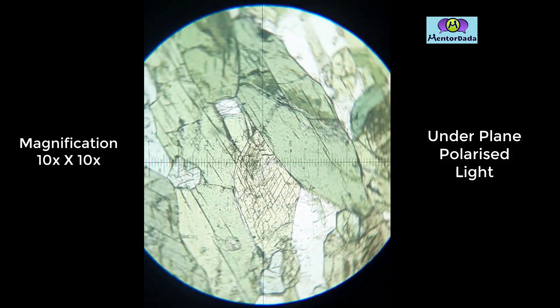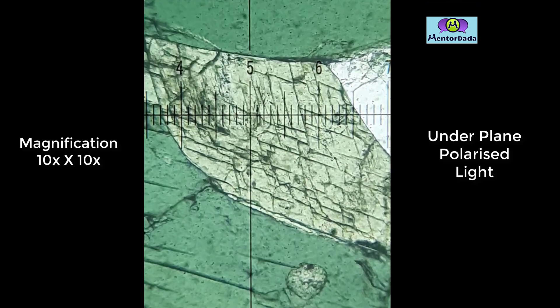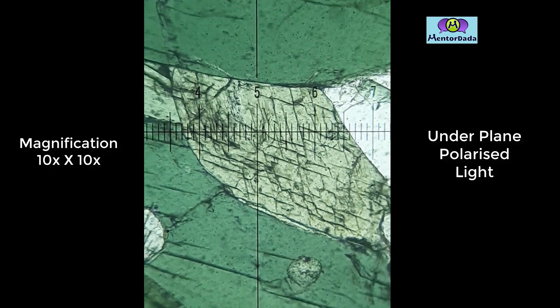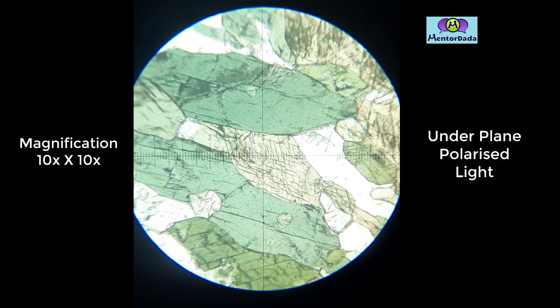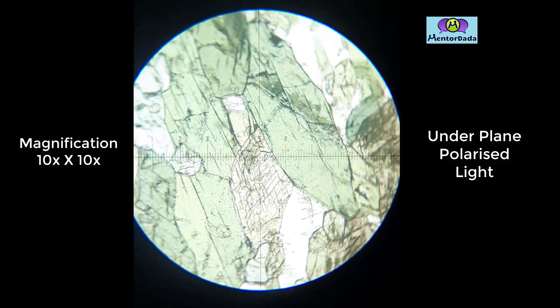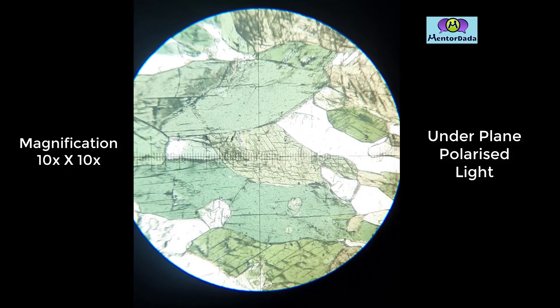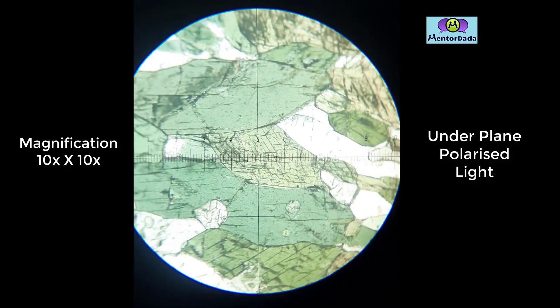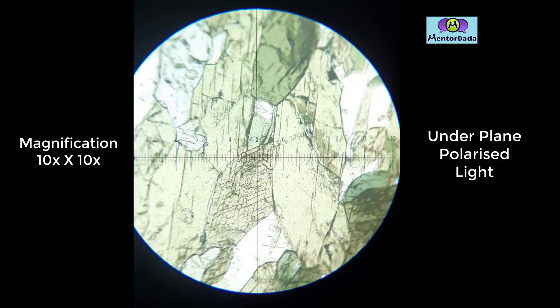This is another mineral at the center of the stage and we will identify this mineral which is exactly situated at the center. The mineral is showing color change, so this is a pleochroic mineral.